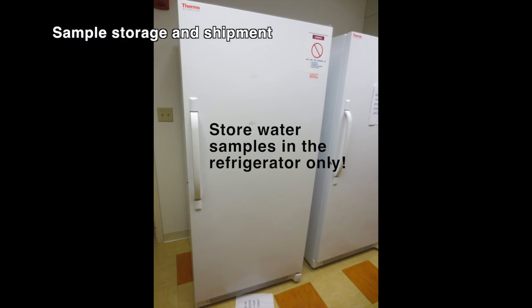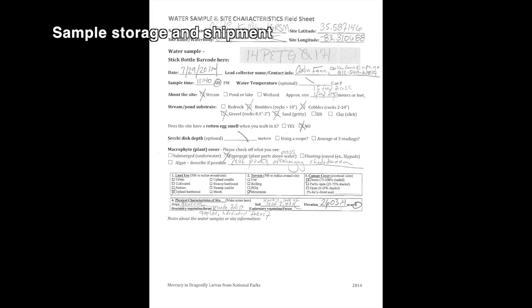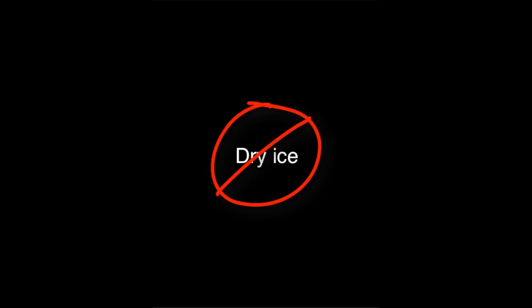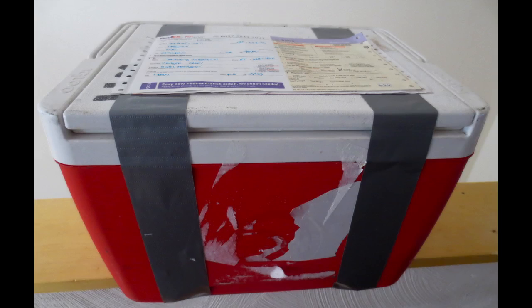When you get back to the lab or office, store the well-marked sample in the fridge until you ship. To ship the water samples, you will need your water sample, the cooler, your FedEx shipping label, clear packing tape, your field data sheet, ice — not dry ice — and your field coordinator's contact information. Contact your coordinator when you are getting ready to ship your sample to verify that someone is available to accept the shipment.